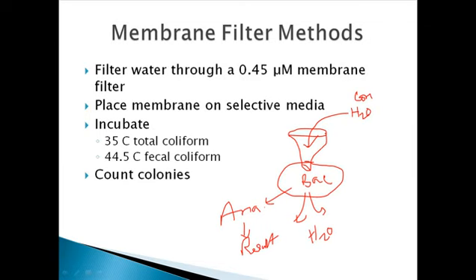Normally the pore size of a membrane filter is 0.45 micrometer. Okay. So normally we can place this filter into selective media to grow, incubate especially coliforms. Suppose we are doing this experiment like which is drawn in this picture. After doing it, we take the filter and place it into selective media. What does selective media mean? Selective media means some type of media which will support the growth of a selective type of microorganisms. In this case, we are checking for coliforms.